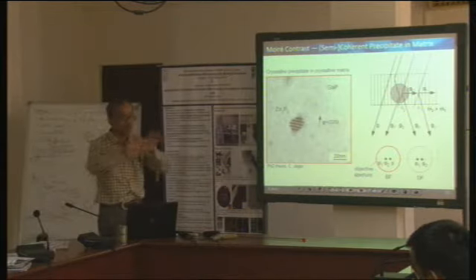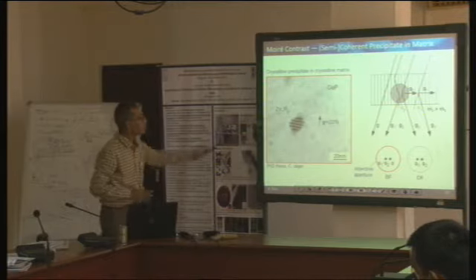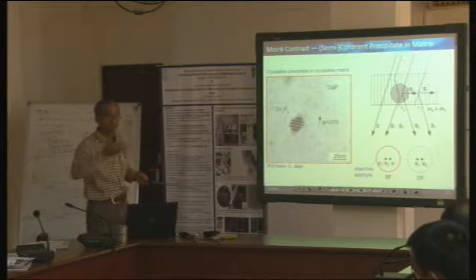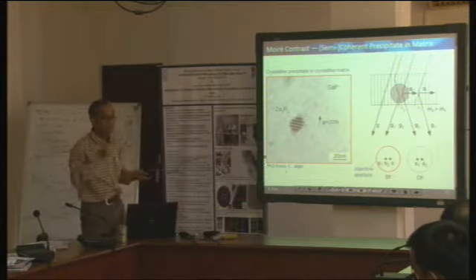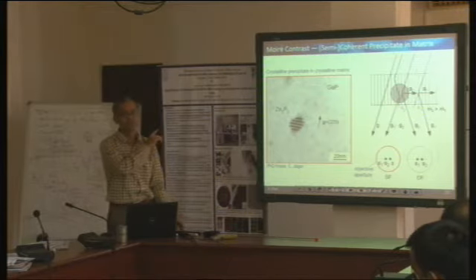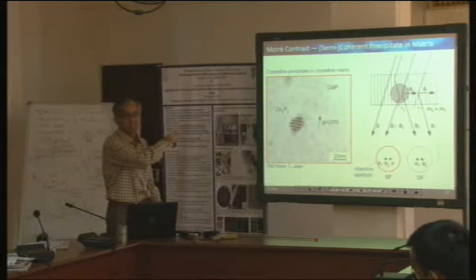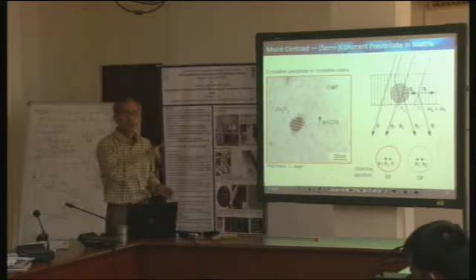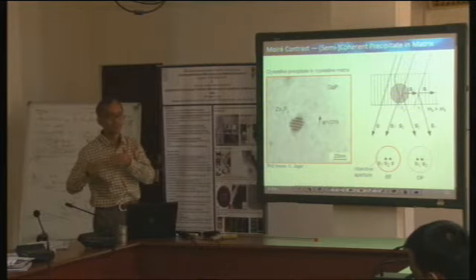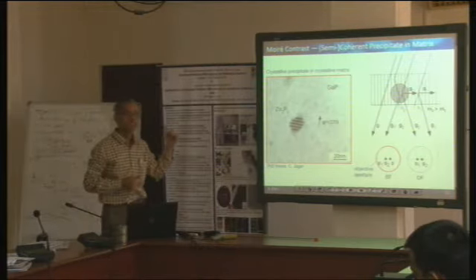All others are not contributing to the image. All the intensity variation that I see is due to the 220 lattice plane which is contributing. And that makes my life easier in a deeper interpretation of the details that I see. This will become even more relevant when we later look at the dislocations. When we try to find out the Burgers vectors of the dislocations, this fact becomes even more important.